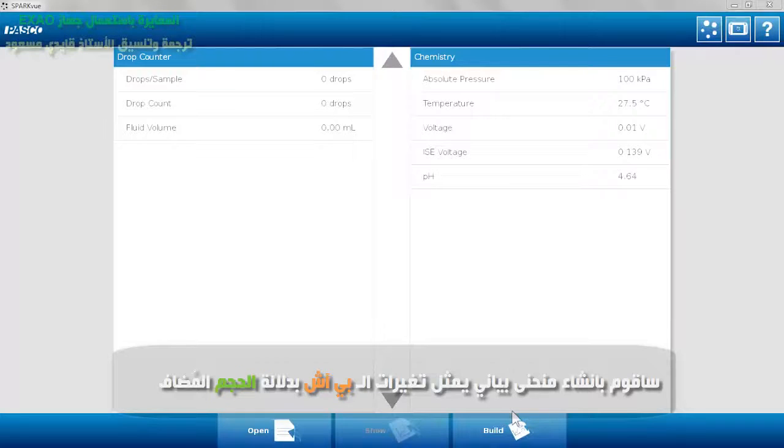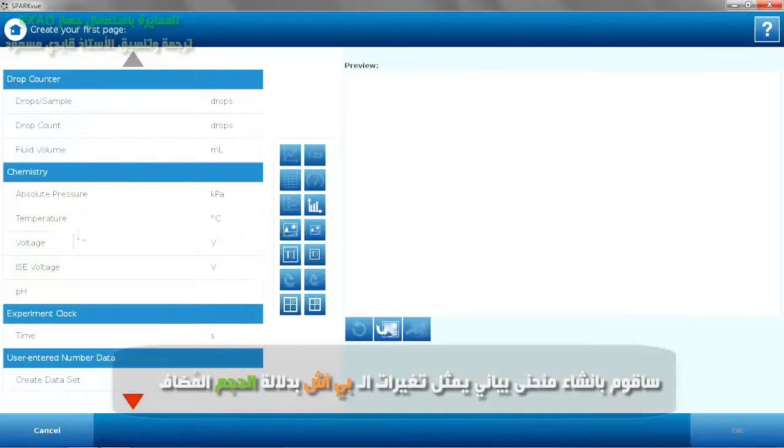I'm going to build a graph — a page of pH vs. fluid volume.